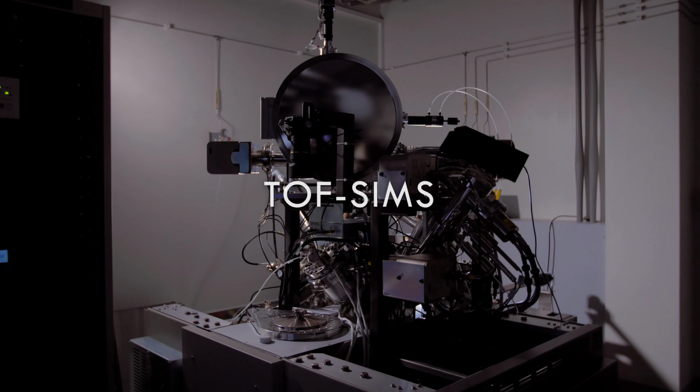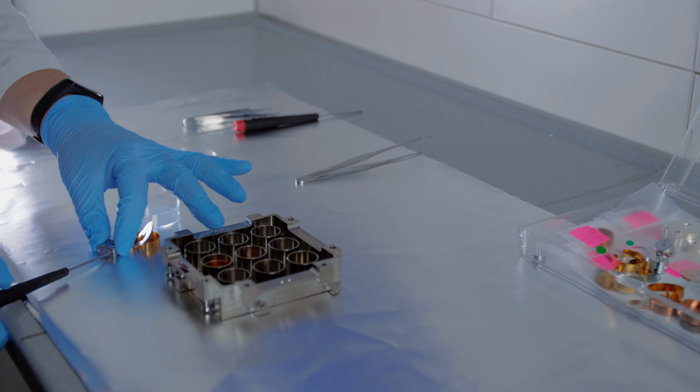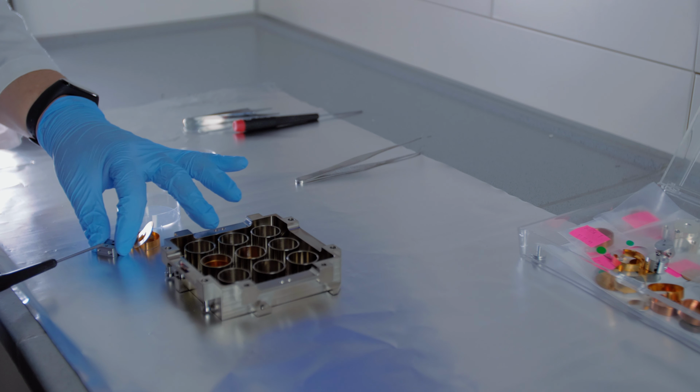ToF-SIMS can precisely pinpoint the regions where element segregations have occurred, and by these processes, reduction of performance or complete failure has occurred. Solid oxide fuel cells are based on oxide ion conductive materials, which gives another approach to failure diagnosis. With the help of ToF-SIMS high mass resolution, which can separate the oxygen-18 isotope from H2O, the use of isotope marking with O-18 can contrast regions of low performance in fuel cells.